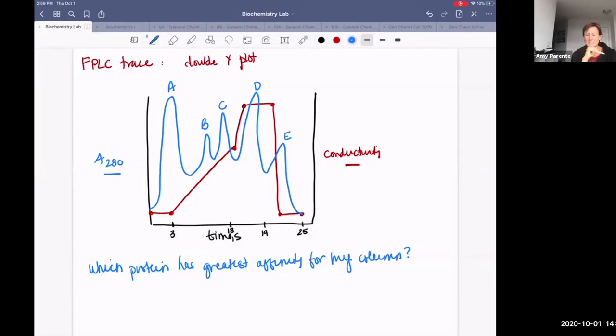You know what? You might start again because you got cut off a little bit. Turn off your video just for a second because we might not have the bandwidth to do both video and audio. I want to be able to hear you. Go ahead. Okay, so pretty much my guess was that peak D was with the high concentration of salts and A wasn't. So based on the peaks, E was kind of in the middle. And that was really my thought process for it. Not sure if that's the right way or not.